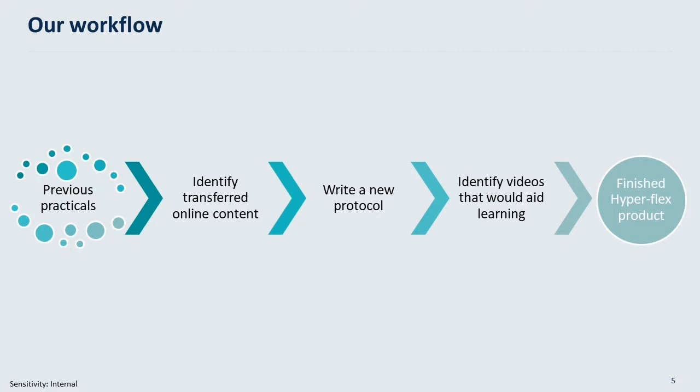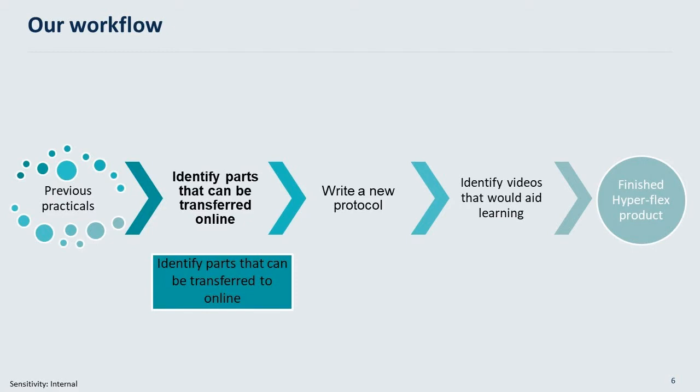So this is our workflow. So we'll just take you through sort of our thinking pattern. So we obviously had our previous practicals with how they were run in person before the pandemic. So then our next step was to identify what of these protocols can be put online, what can we keep, what do we think would transfer well over to an online format.